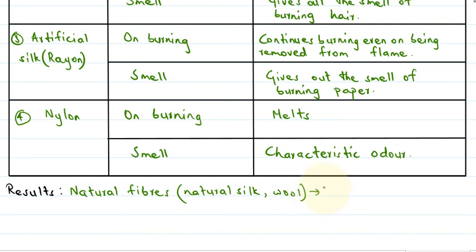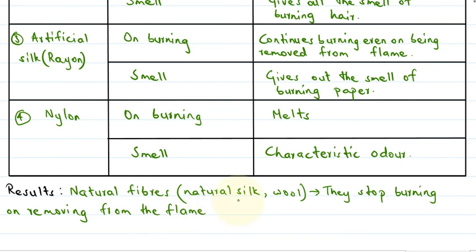They stop burning on removing them from the flame, and they give out the smell of burning hair. Okay, so this is the result.